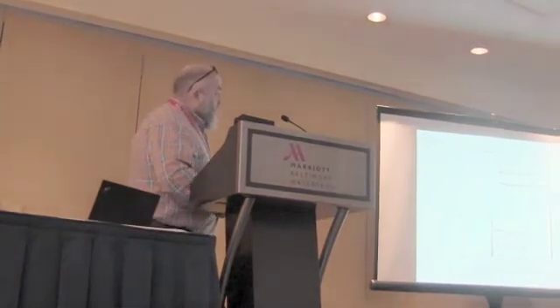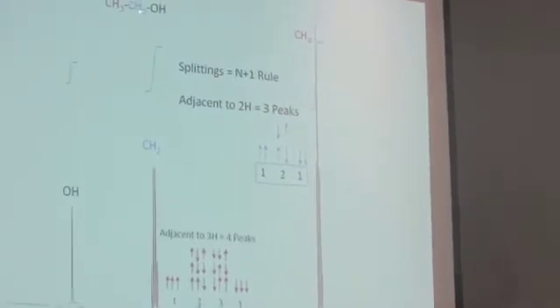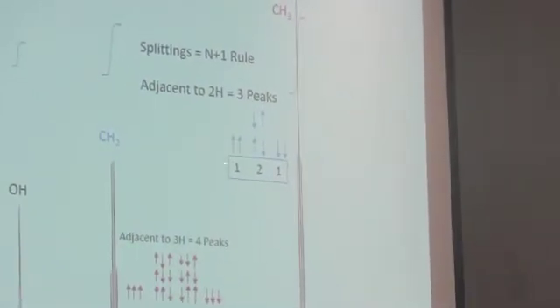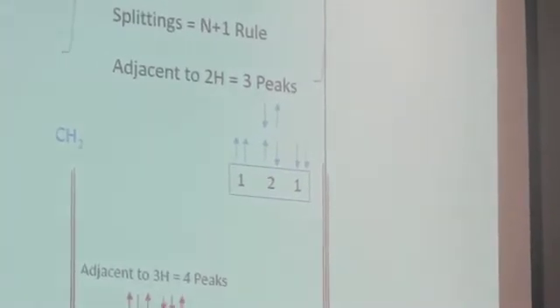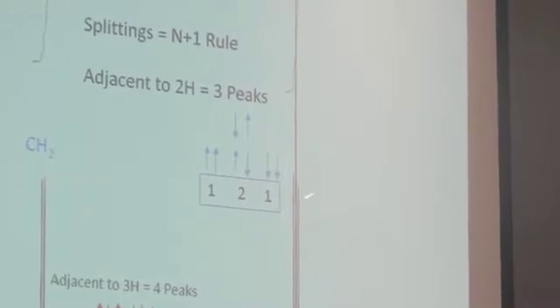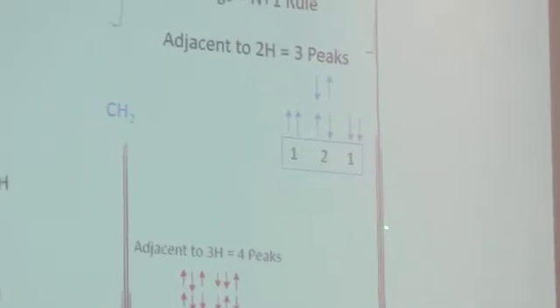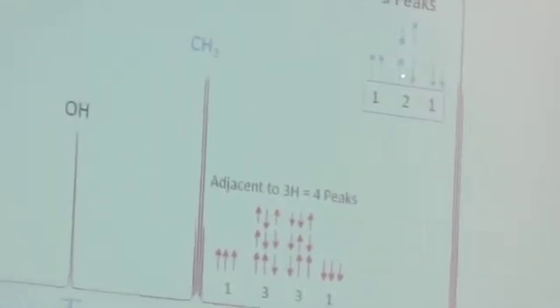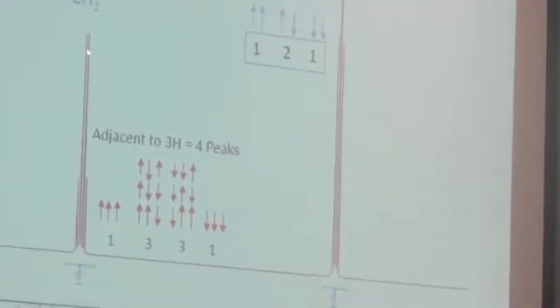But what I wanted to show you is that when these protons here are right next to these protons on this CH2, the way that each one of these protons can see these CH2s is they can see either both of those two guys over there are pointing up, if you imagine spins in a magnet kind of pointing with the magnet. Two of them are up, or one's down and one's up, or one's up and one's down, or they're both down. Those are the combinations, right? So this is why this signal is split into 1 to 2 to 1 peaks. It's a triplet.